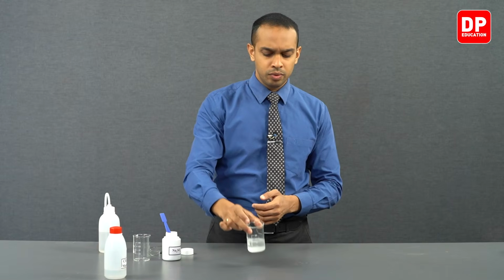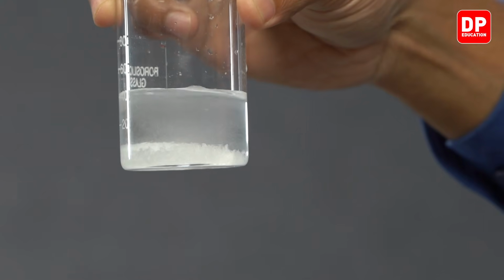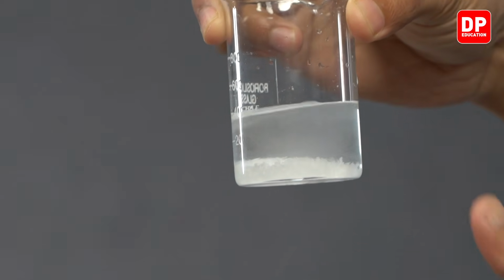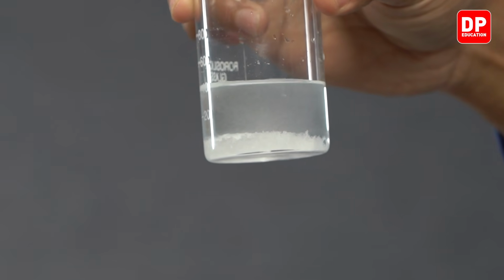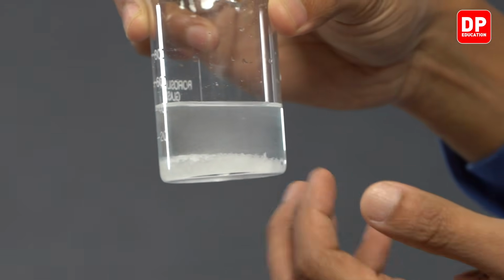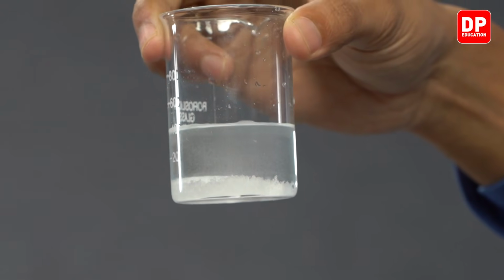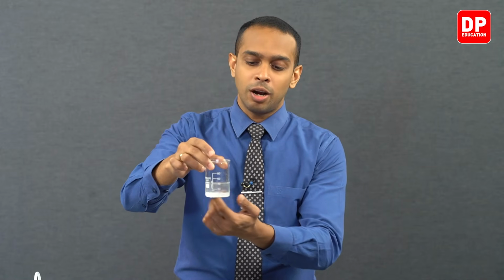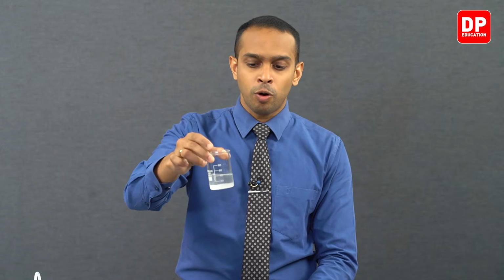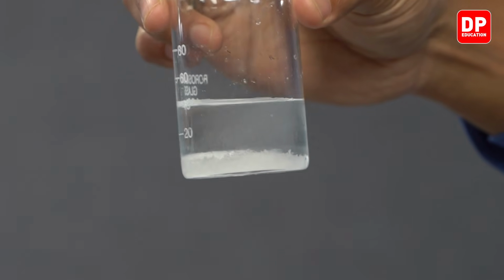Now students, you can see how the sodium sulfate has gotten clumped together when it has come into contact with water. So some of the sodium sulfate has dissolved in water, but the rest of it is now forming clumps of sodium sulfate solid. So when we added sodium sulfate into water, after they come into contact with water, we can see how the sodium sulfate is forming clumps rather than being present as a powder in the aqueous medium.